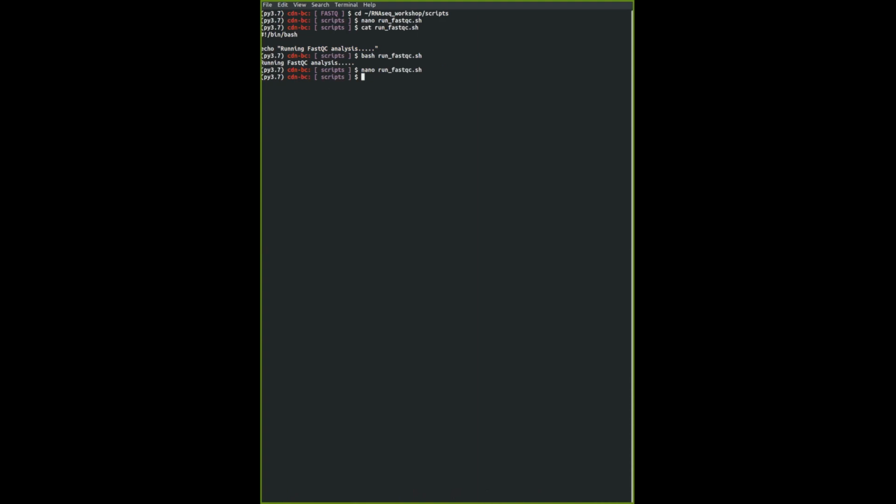All right, before I run, just make sure that everybody is on the same page. Just give me a thumbs up if this is fine, if you get the same sort of text as I do. I can cat this again just to make sure that you see the code. Just make sure that you are following along with this code. Generally okay. Good. Okay, and then we can start. So run this bash script. So bash followed by run_fastqc.sh and press enter. Ready?